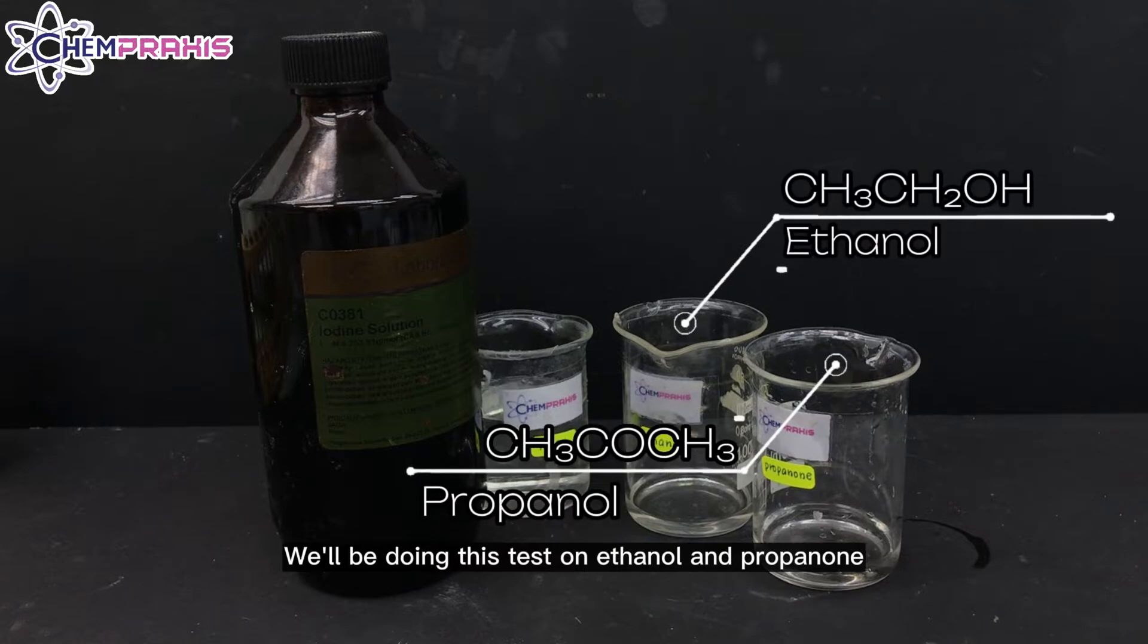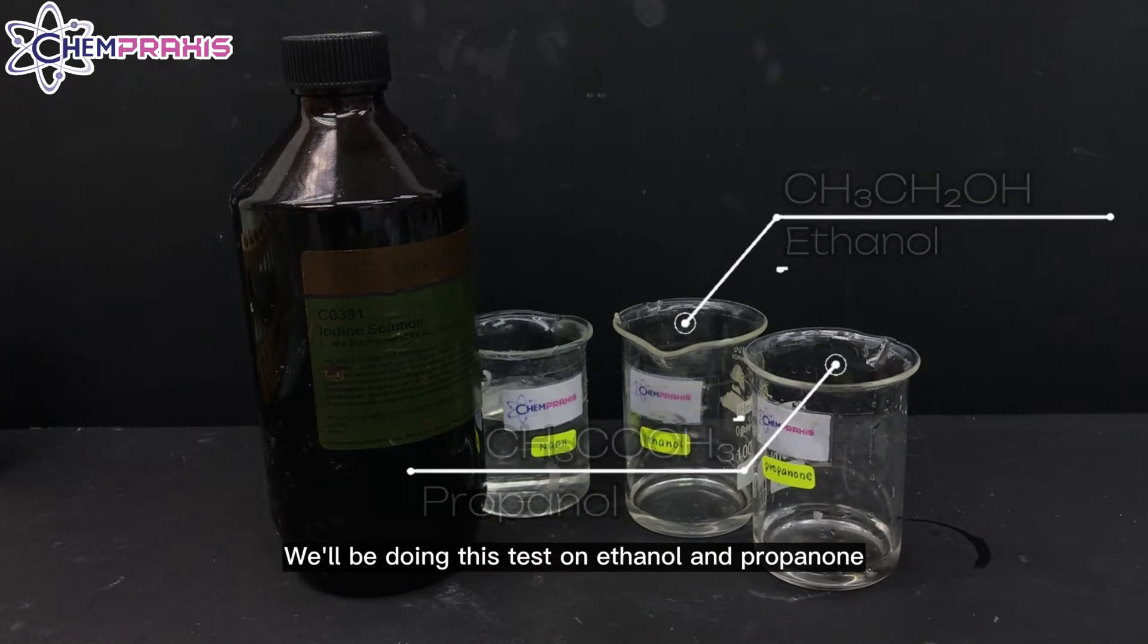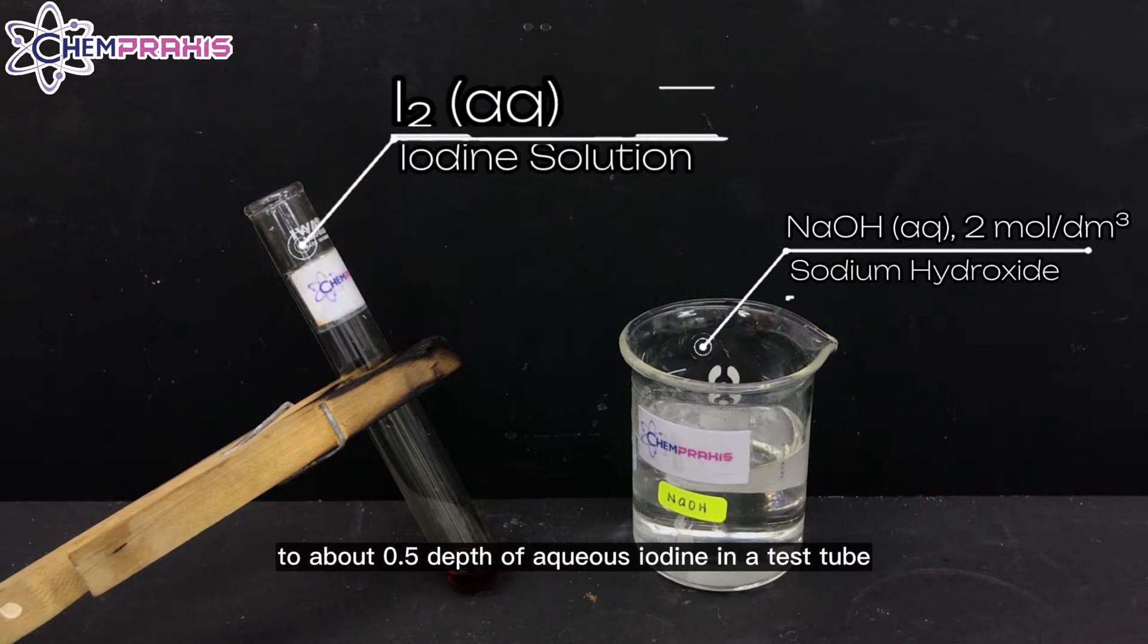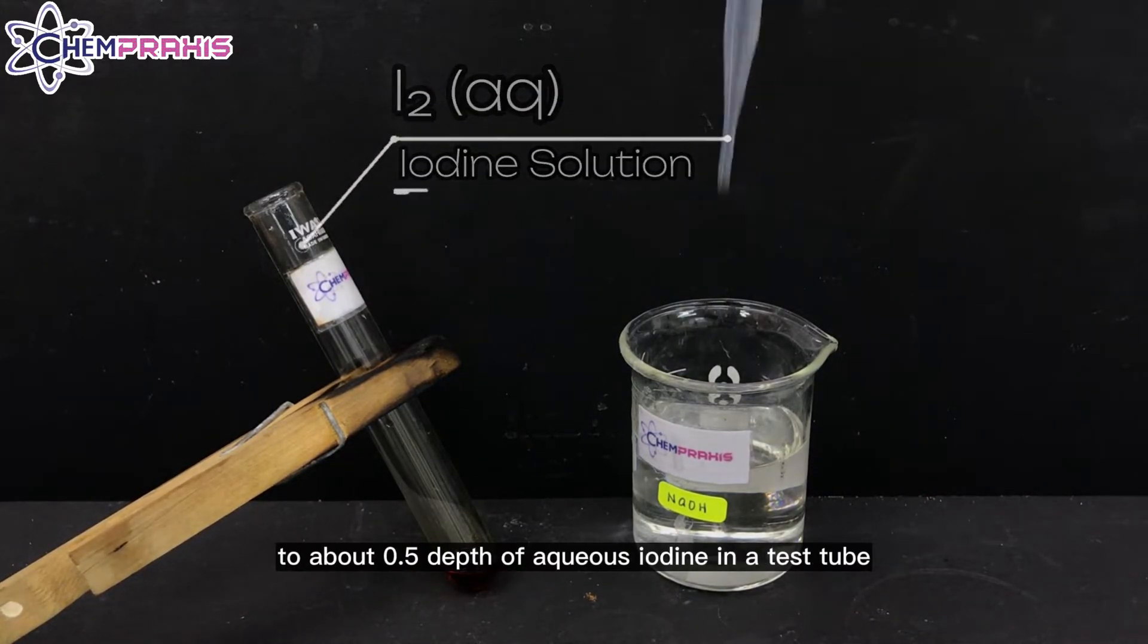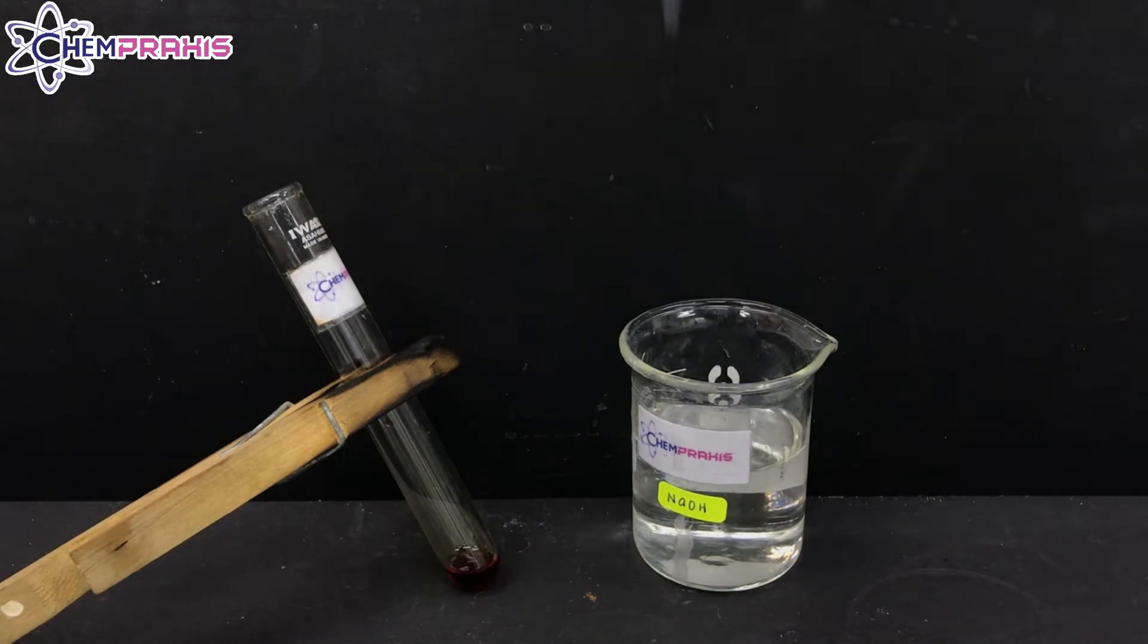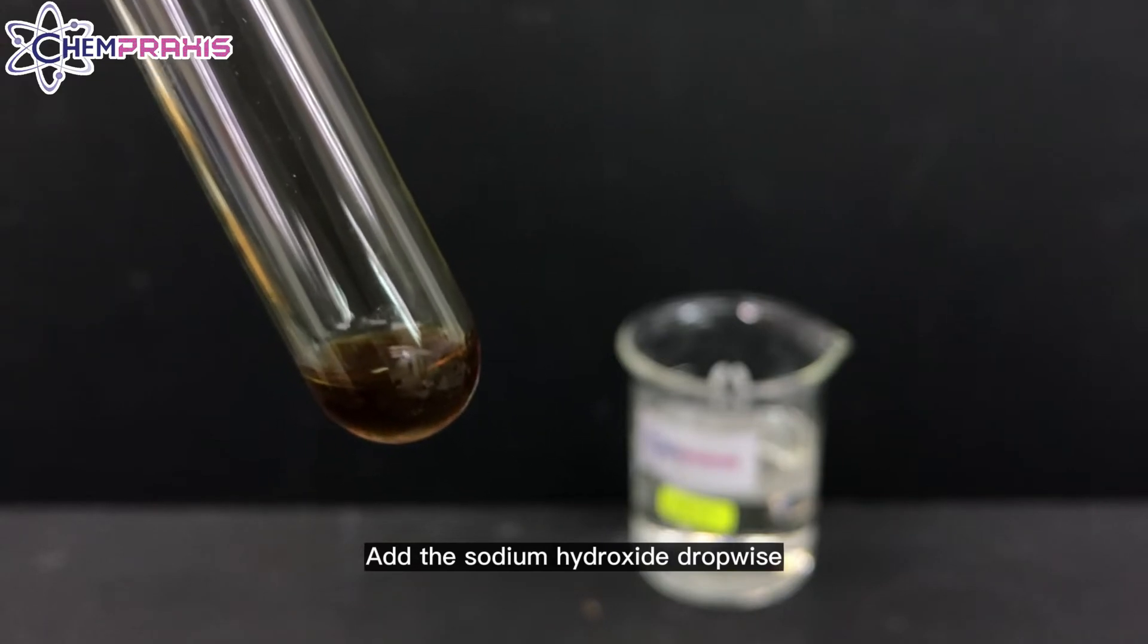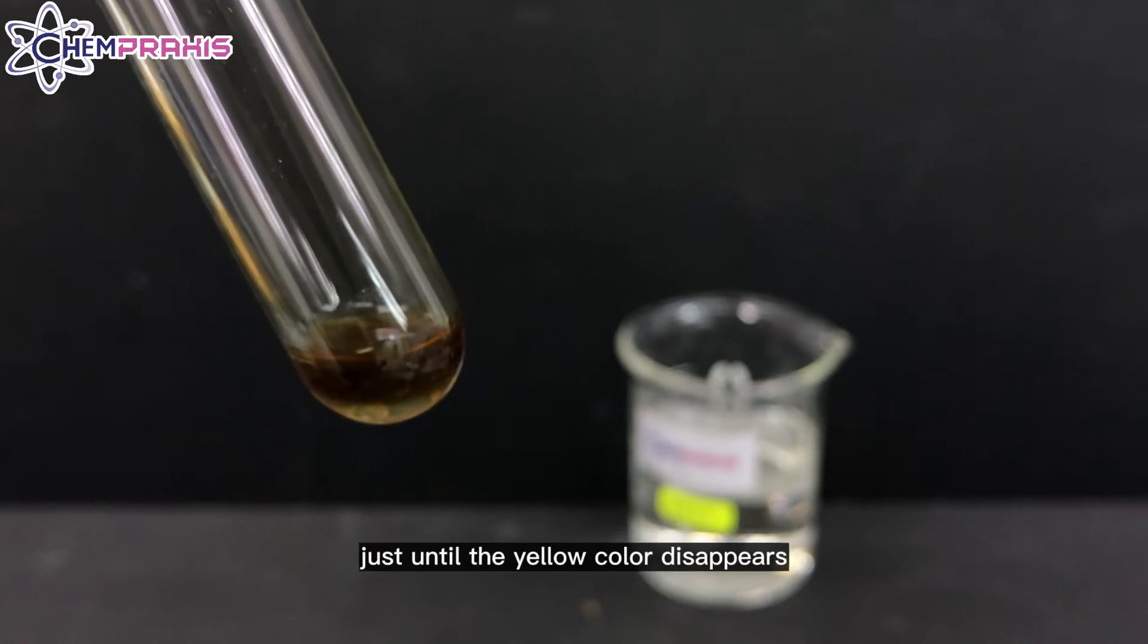We'll be doing this test on ethanol and propanone. First, we'll add some aqueous sodium hydroxide solution to about 0.5 depth of aqueous iodine in a test tube. Add the sodium hydroxide dropwise just until the yellow color disappears.